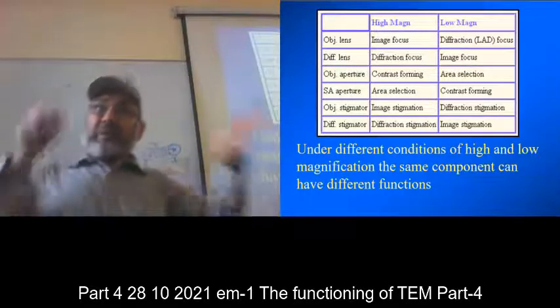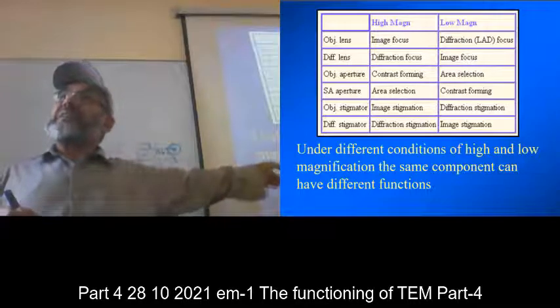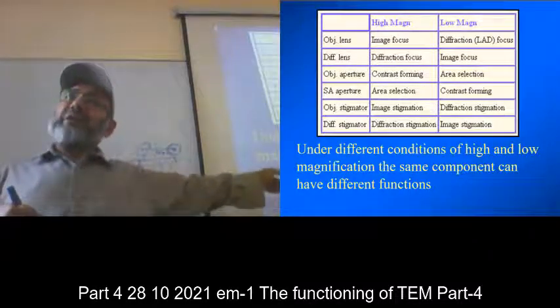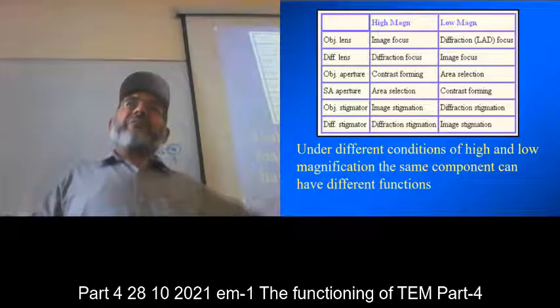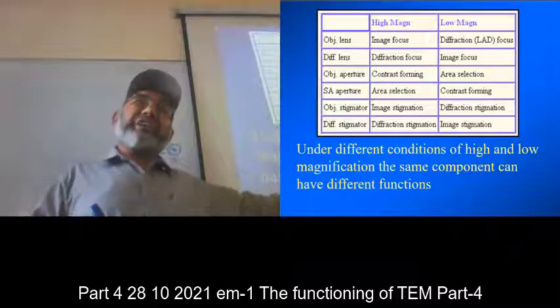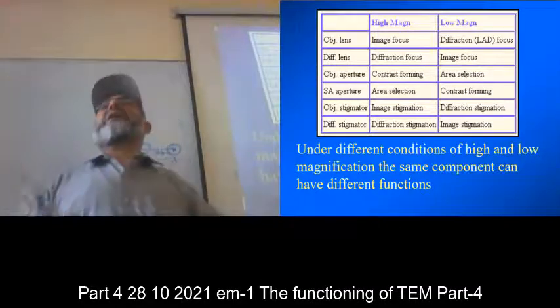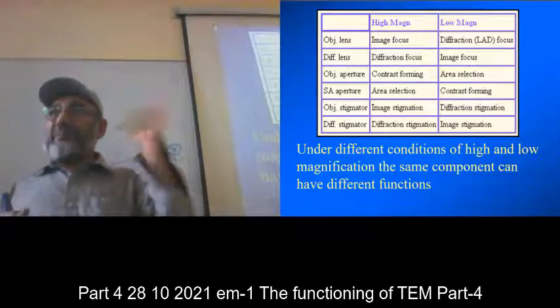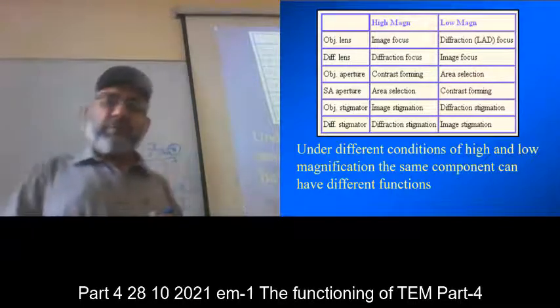If a spot is very intense, it can burn the screen. It is an electron beam, and when it is so intense it creates heat, and that heat burns the screen. So you are keeping a compromise between the brightness, the intensity, and the geometry of the spots there.